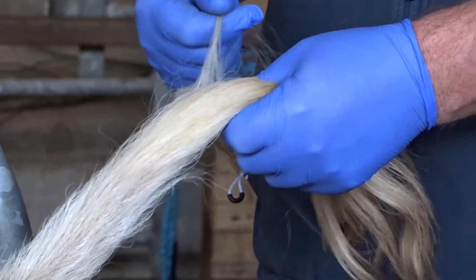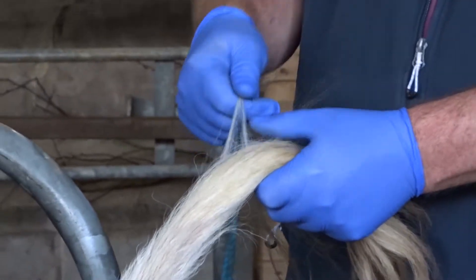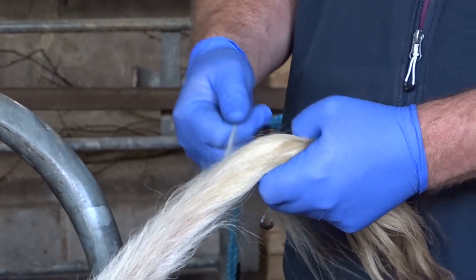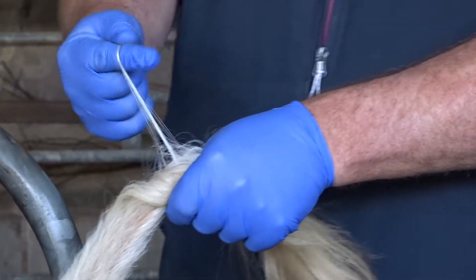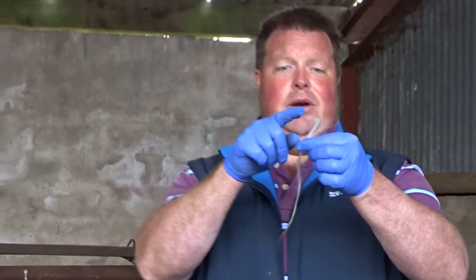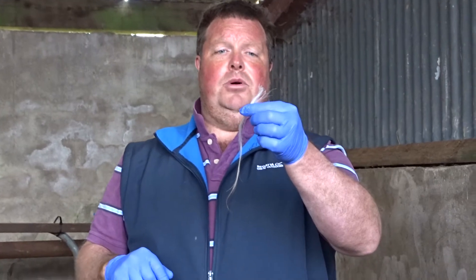Basically what I do is I grab roughly about 40 strands of hair — not too many, not too little — wrap it around my finger and pull. These here are the root follicles, and these are the most important.